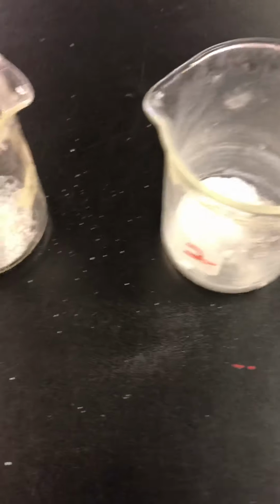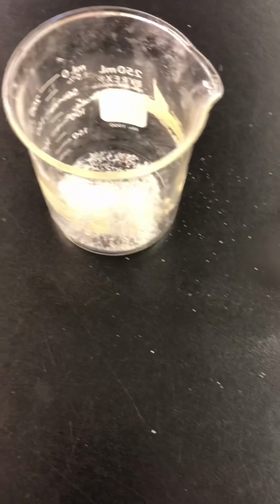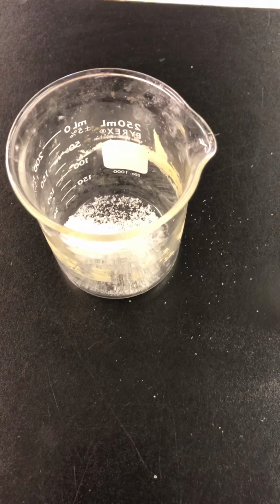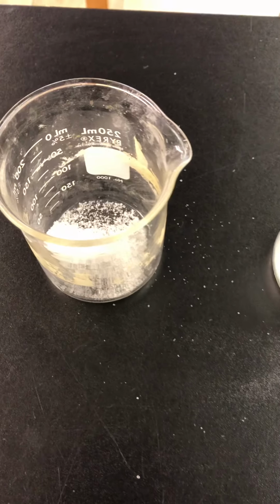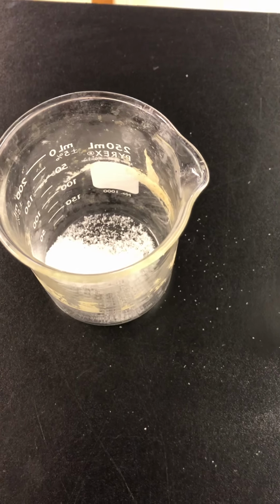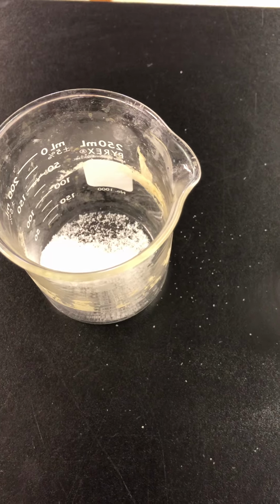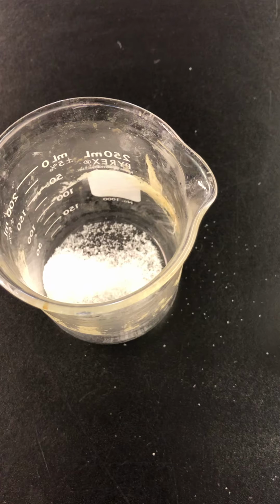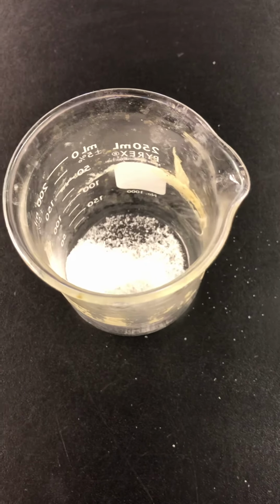Okay, good. Okay, so what we're going to do now is we are going to add water to each of these solids. So what you are going to decide based on what you see is whether the solid is soluble or insoluble. Quick recap, soluble means that it can dissolve in the water, and it does dissolve, which means you will see most of it disappearing. There won't be very much left. Insoluble means that you can still see the solid in the water.